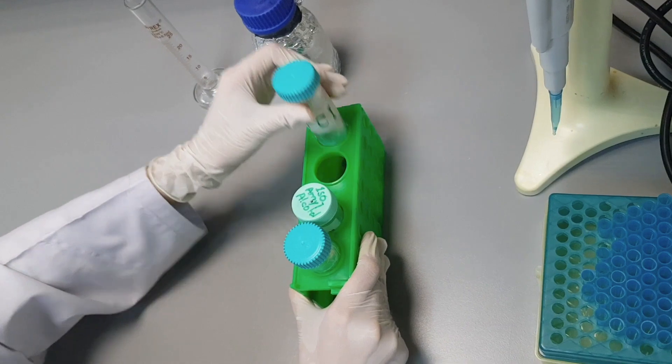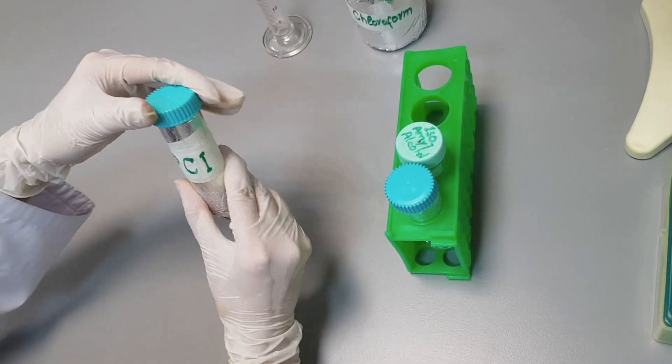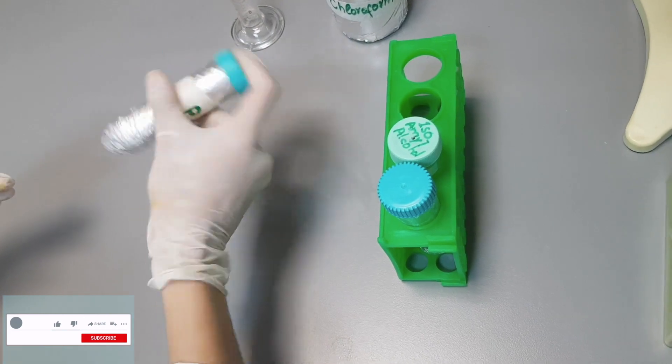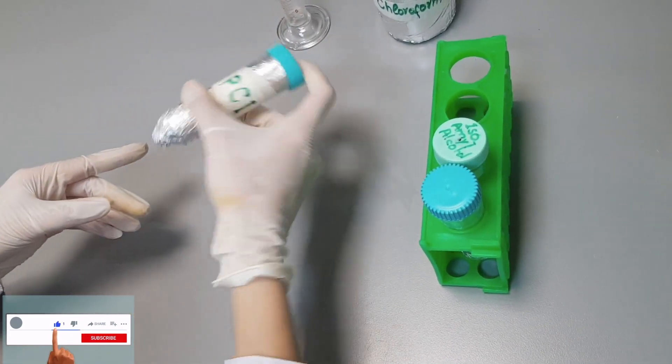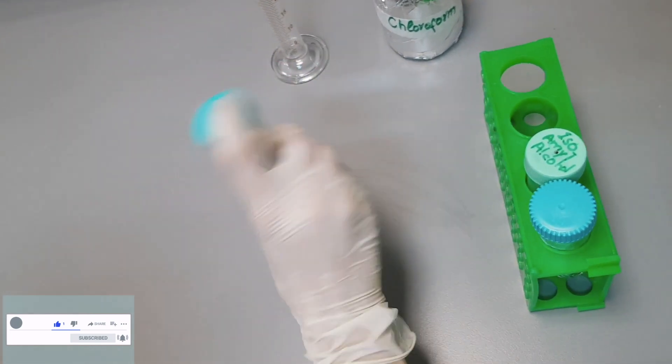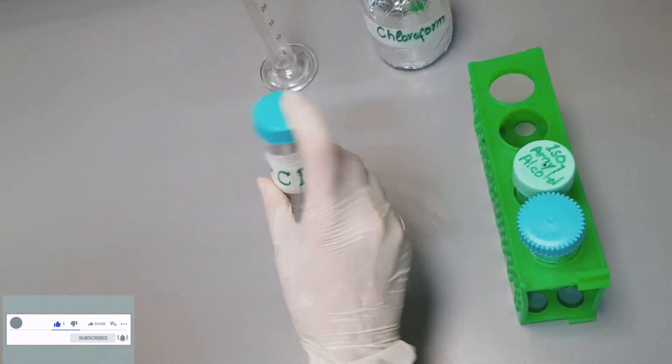As phenol and chloroform are light sensitive, wrap this tube with aluminum foil. Plus, don't forget to prepare this solution in a light-free environment. Mix the solution thoroughly and leave it overnight.